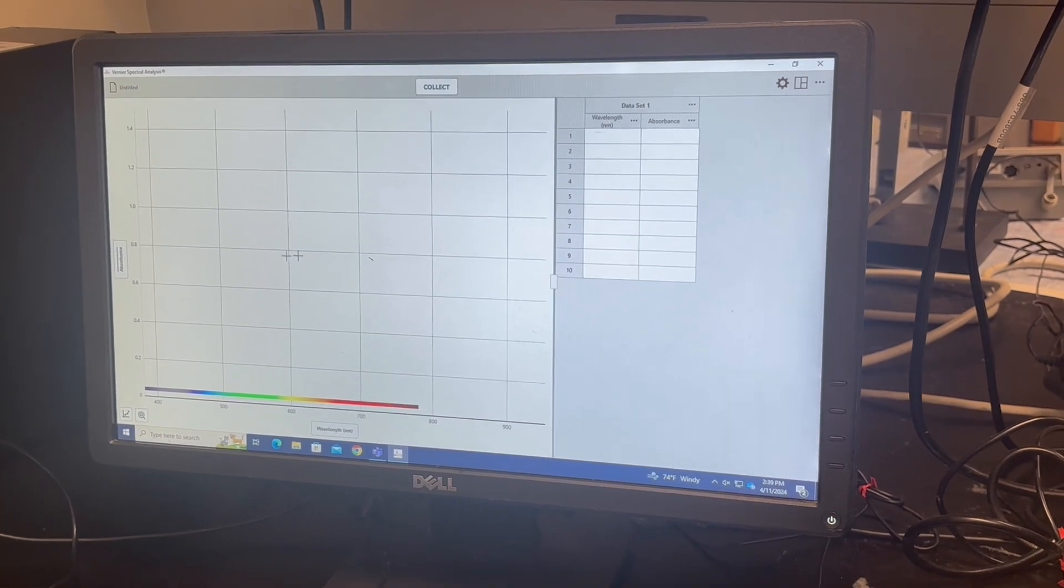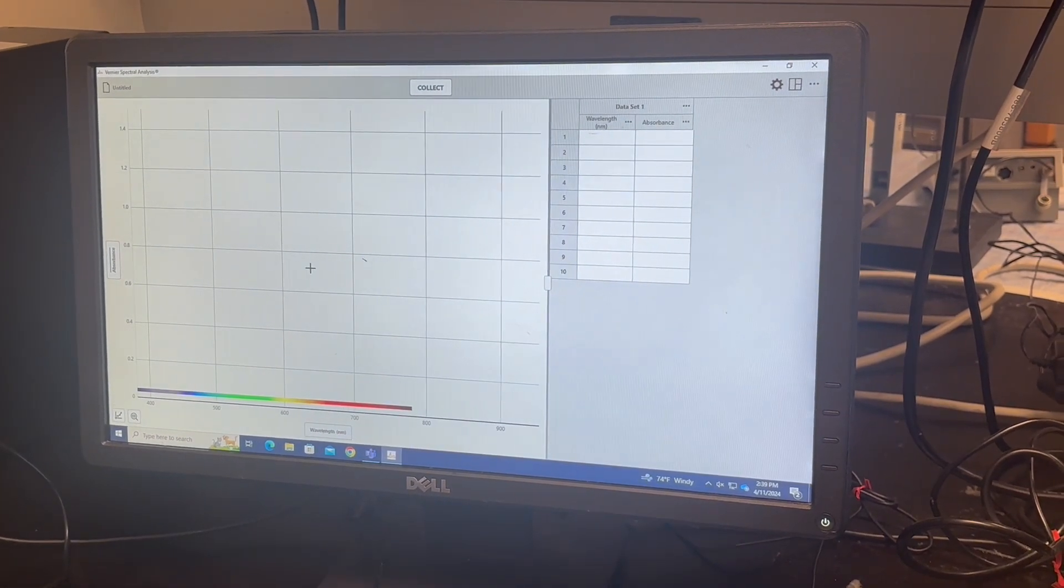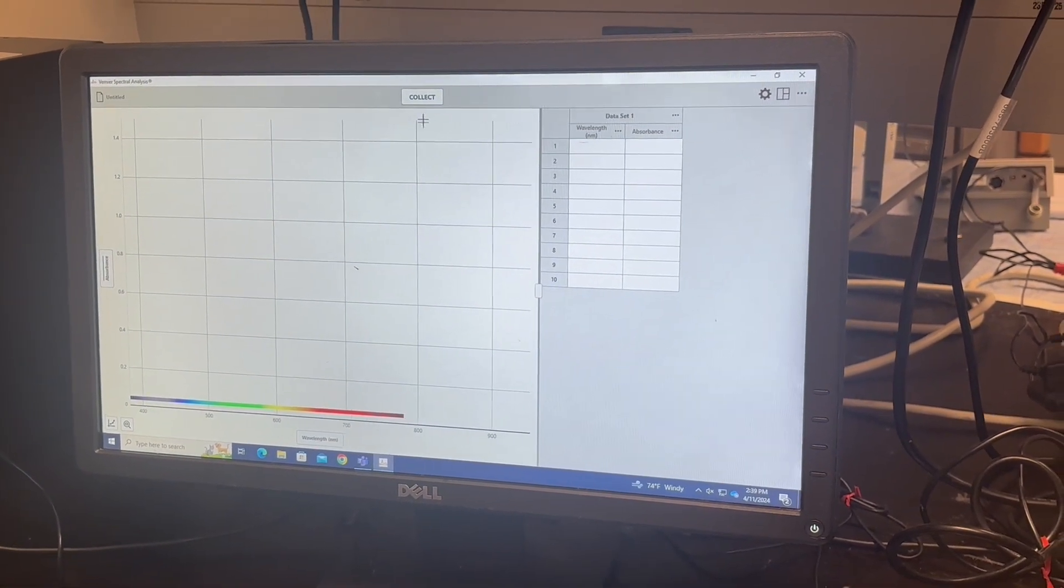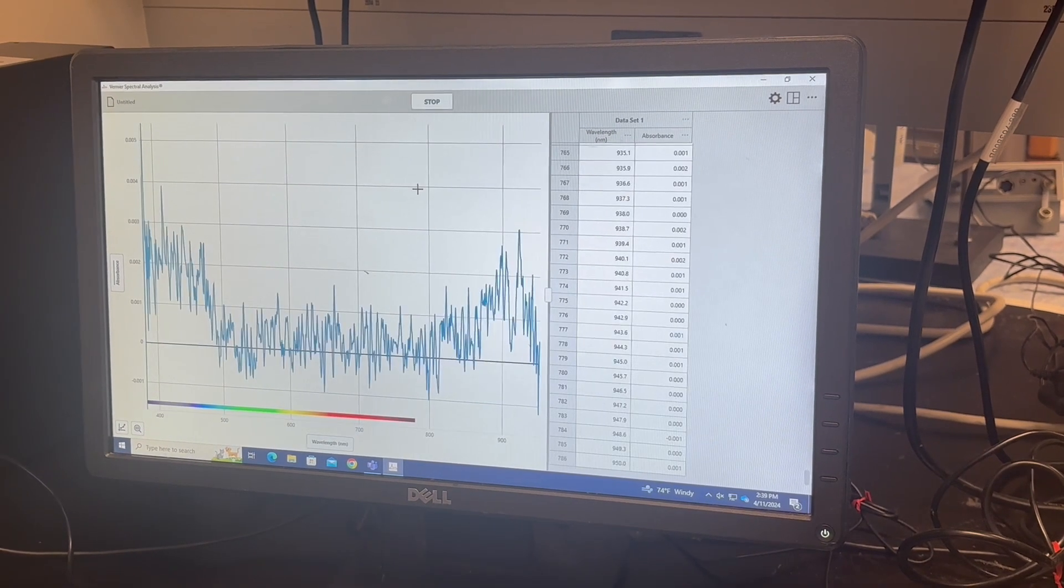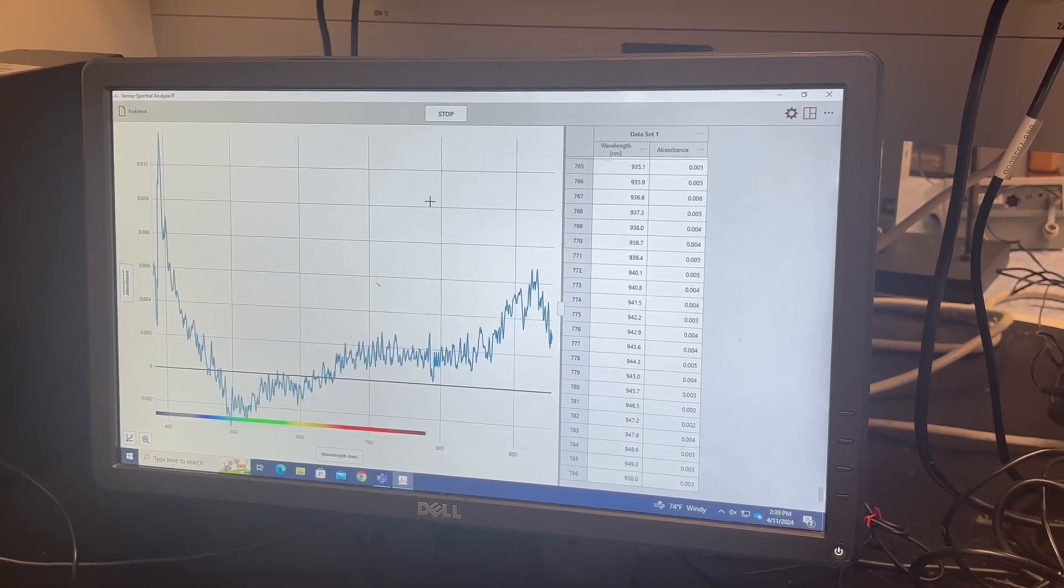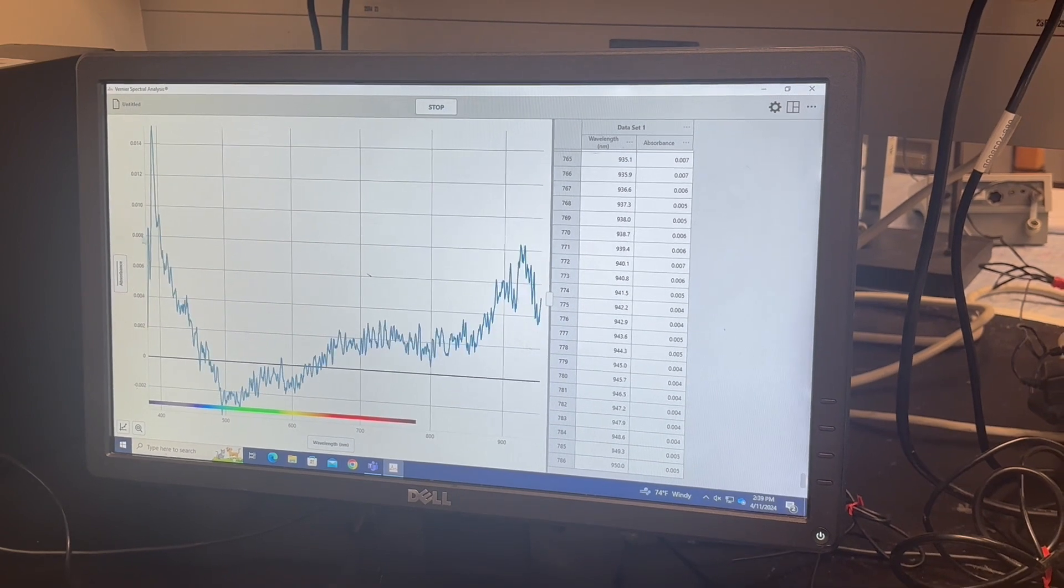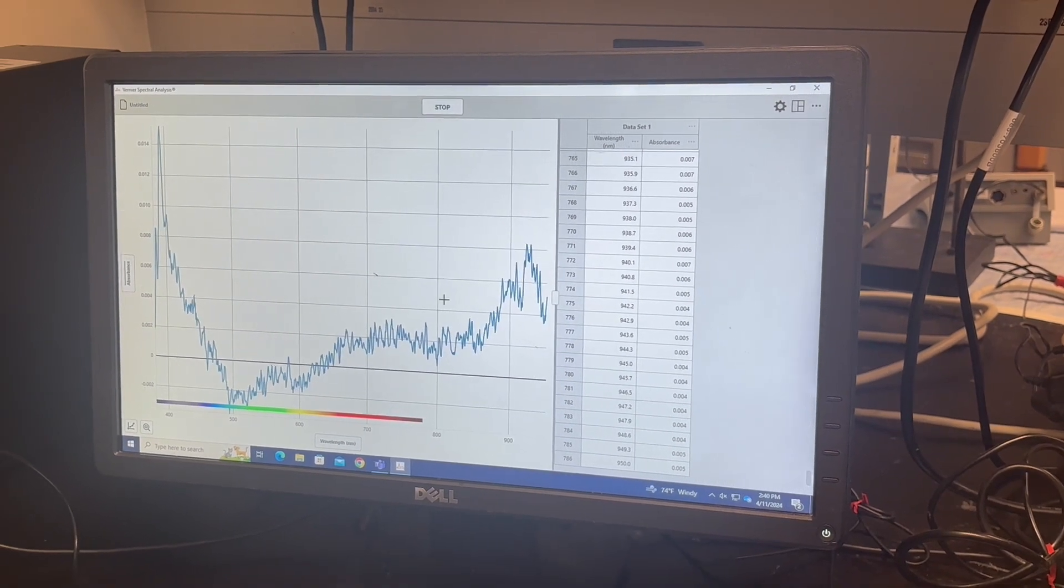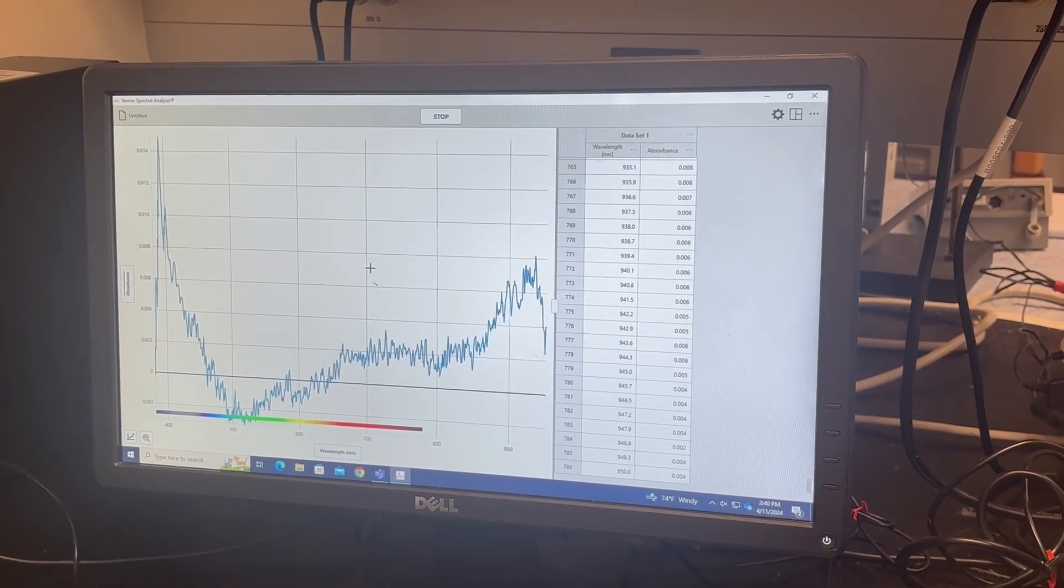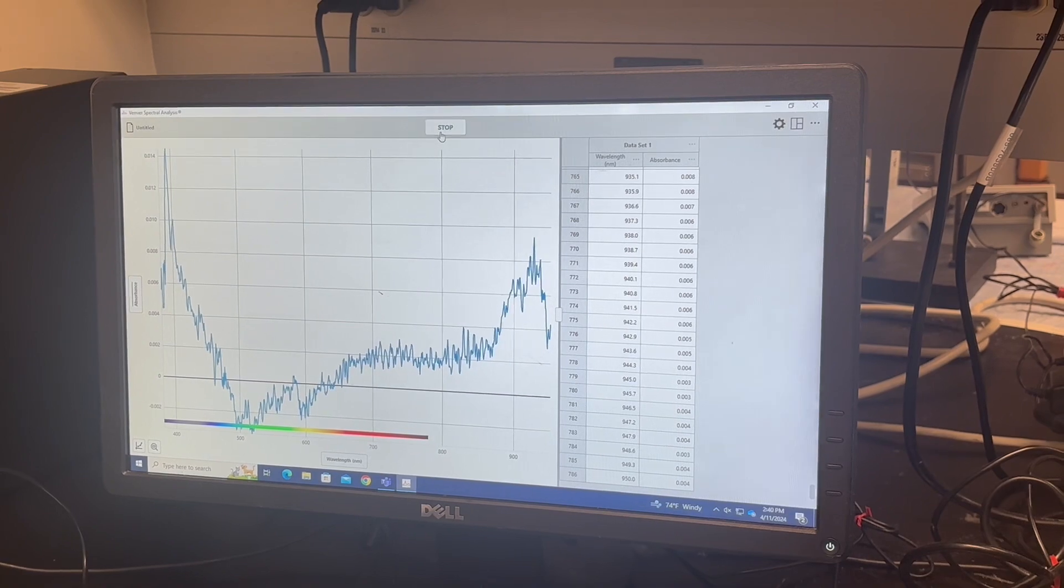We ran our blank. So now we go to collect. This is our blank right now. Obviously we're not seeing too much. It's all very low absorbance. And we can hit stop.